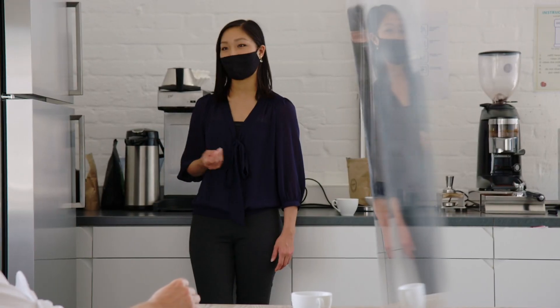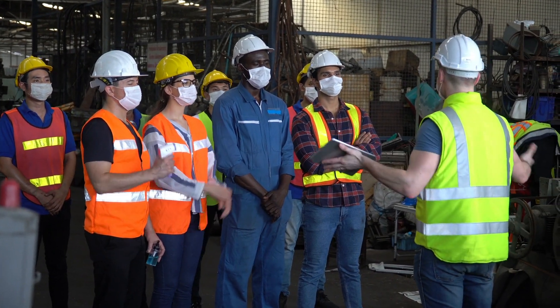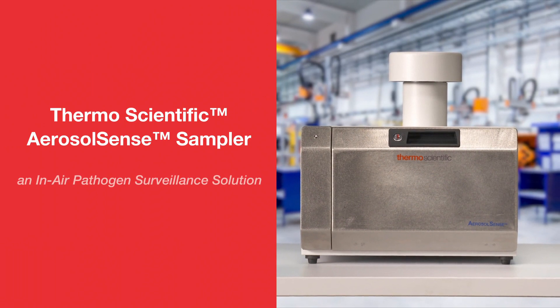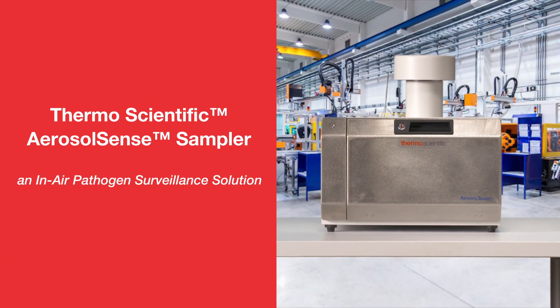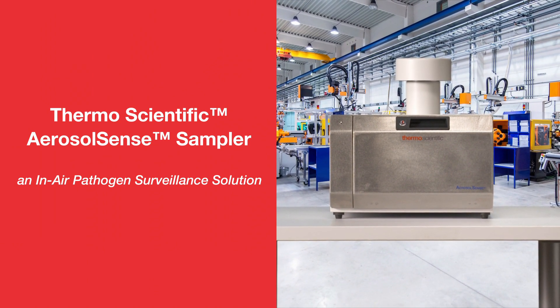From waiting rooms to break rooms, classrooms to manufacturing floors, and indoor spaces of all kinds, the Aerosol Sense Sampler is designed to deliver fast and highly reliable insight into the presence of in-air pathogens, including SARS-CoV-2, supporting your safety protocols, and helping protect your people and your community.